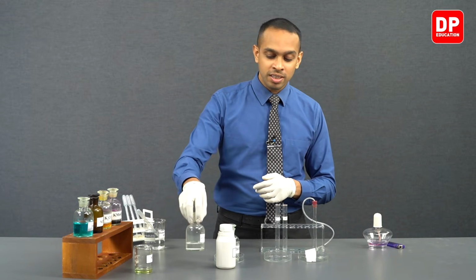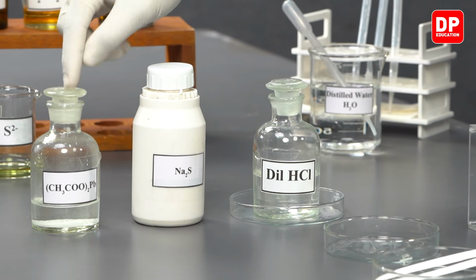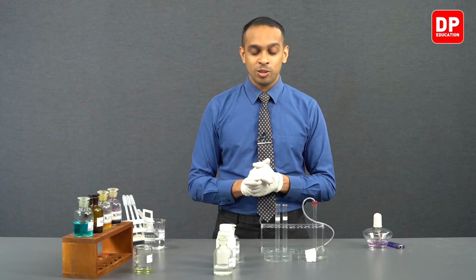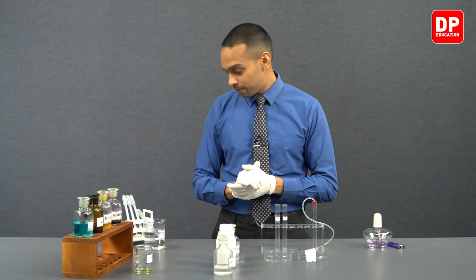So we have our lead acetate here. We are going to take a small amount of lead acetate into a petri dish and we are going to soak it in a filter paper. And after that, when hydrogen sulfide gas is produced, we are going to introduce the hydrogen sulfide gas onto the filter paper that is soaked with lead acetate. So let's move on to conducting this experiment.